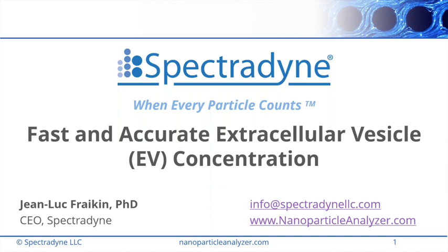Great, thanks. There's another comment followed by a question, and I'll read the comment out first. With the NCS1, the enumerated EV counts and concentration are highly dependent on how the background thresholding and noise floor is defined, which tends to get messier close to the LOD around 50 to 60 nanometers. That's the comment. And the question is, what do you recommend as best practices for defining this background noise? Jean-Luc, again, a question for you.